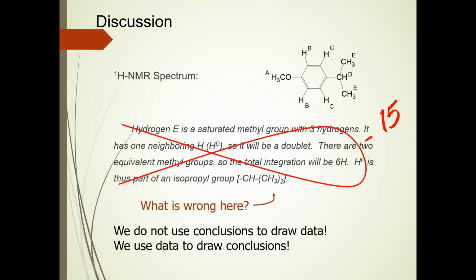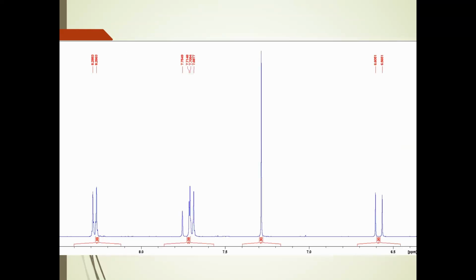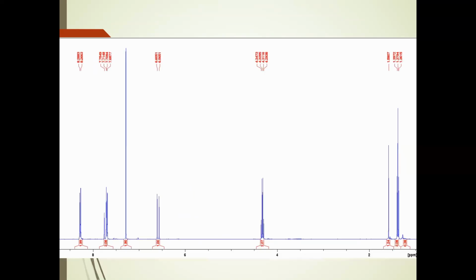All right, then we will go to the spectrum. I've got a couple here in this presentation I'm going to look at, but I think maybe I'll abandon this and go to the actual spectra. But your spectrum should look a bit like this. Actually, let me back up one. There are 2 peaks here that are important to recognize.